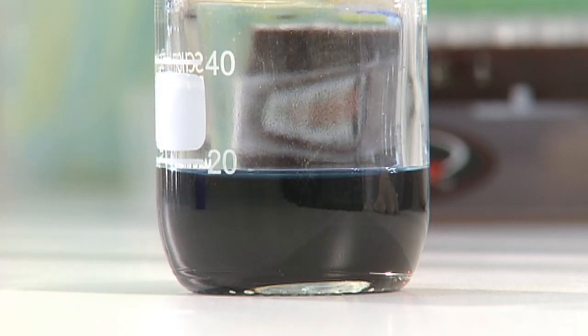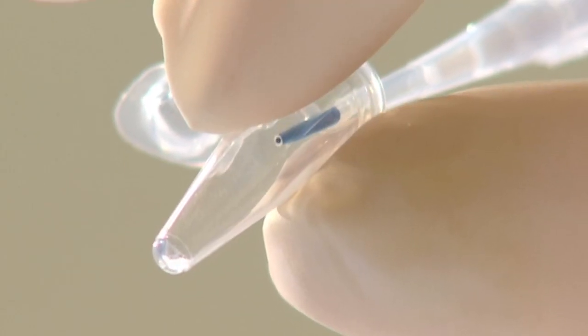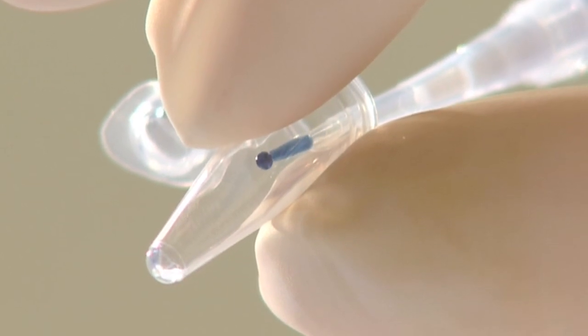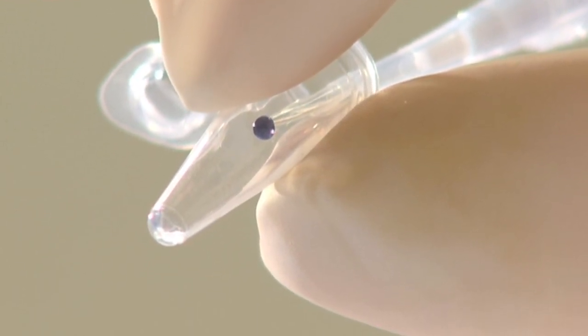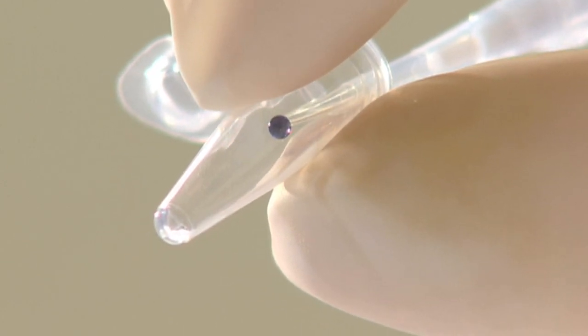For very small volumes, the aspirated liquid can hang in a drop from the end of the tip and may not be transferred to the tube at all. You should touch the tip to the inside wall of the recipient container whilst expelling the liquid.